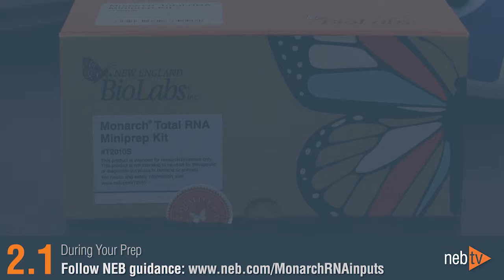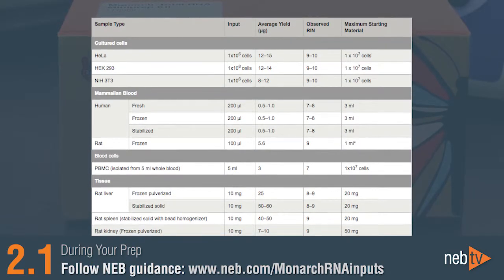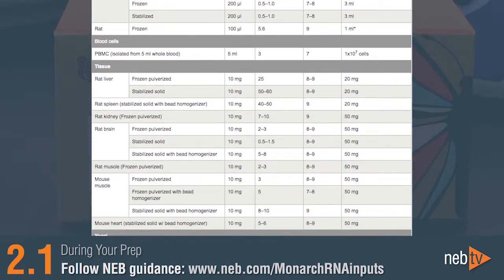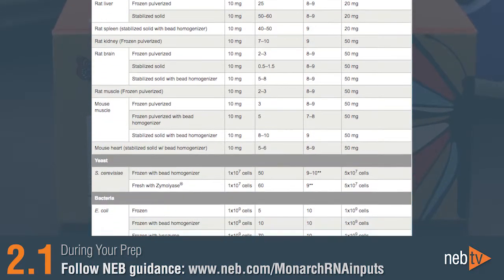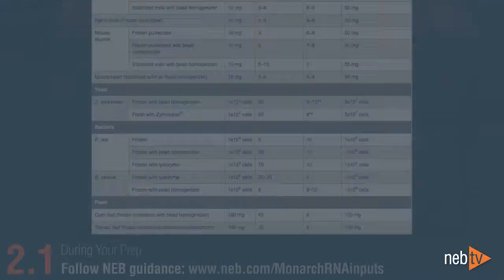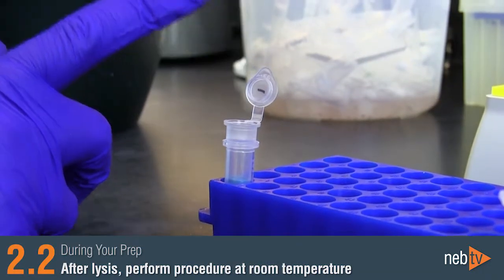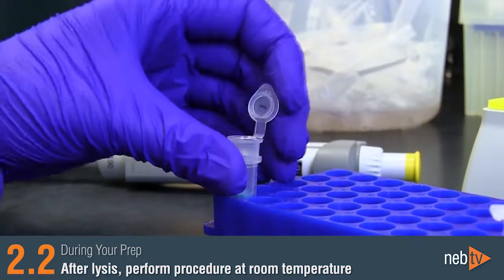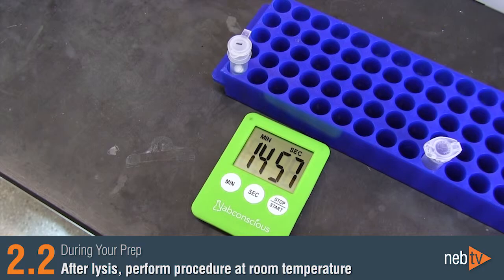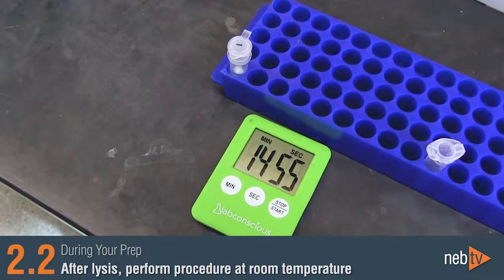Be sure to follow our guidance on the recommended sample input amounts in order to ensure that the buffer volumes are appropriate and that the columns are not overloaded. This is a common mistake that can quickly reduce yield, purity, and integrity of your RNA. After sample lysis, perform all steps at room temperature. This will prevent detergent from precipitating in the buffers. Do not place your samples on ice after lysis.